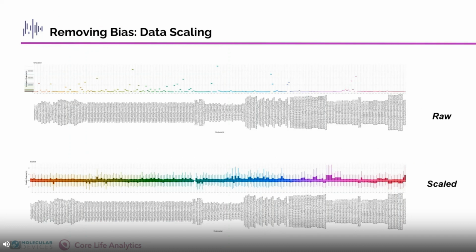And then here is a whole bunch of features from Angeline's dataset. As you can see in the raw data up here, the x-axis are the features she extracted, and the y-axis is the numerical range. Some of the measurements that she has can be up here in the tens of thousands, and this will overwhelm the ones down here.